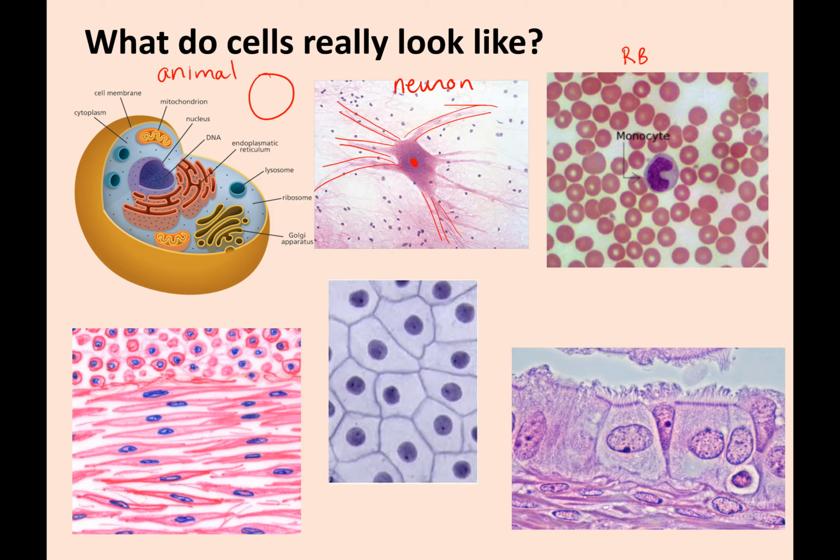These are red blood cells, and the monocyte in the middle is a white blood cell. White blood cells are really big, and they have this weirdly shaped nucleus. This is one of the ways you identify them. Red blood cells actually have lost their nucleus, so they look like little pillows, little donuts. They are a whole cell, just kind of how the light is reflecting. These images are all taken with light microscopy. Here is an epithelial cell, so your skin cell.